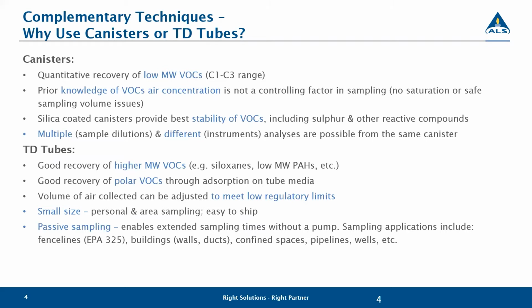I know that when you're looking at MECP, C of A's, or certificates of approval, or ESAs, depending on the terminology, there is always a note that they need to be sampled or analyzed within 24 hours. And that was traditionally based on using Tedlar bags. So just a background on that, traditionally sulfur was sampled into a Tedlar. It has a shorter hold time. The canister does afford you some additional stability and a little longer hold time.